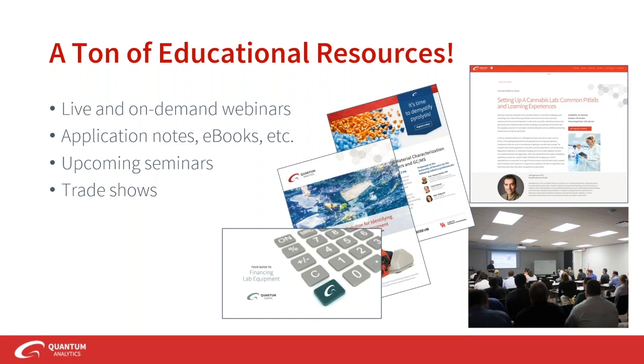It is a very precise instrument, from the goniometer to the crystals that are present, depending on the number of crystals you have in there, to the collimators and the number of collimators that you have, and so on. It's a very useful tool. However, because of its complexities, it also requires some additional services and resources. So usually warranties are all included in the cost of an instrument too.